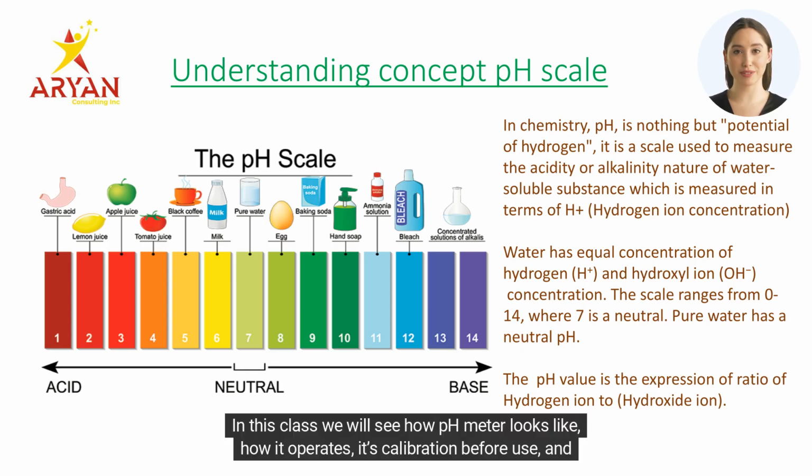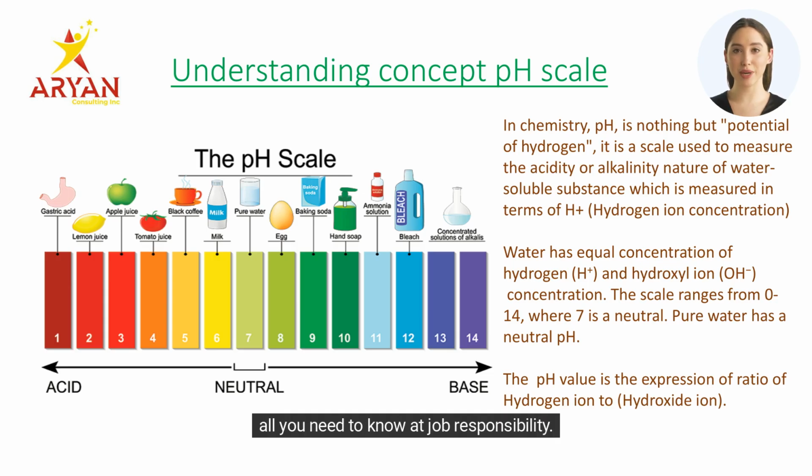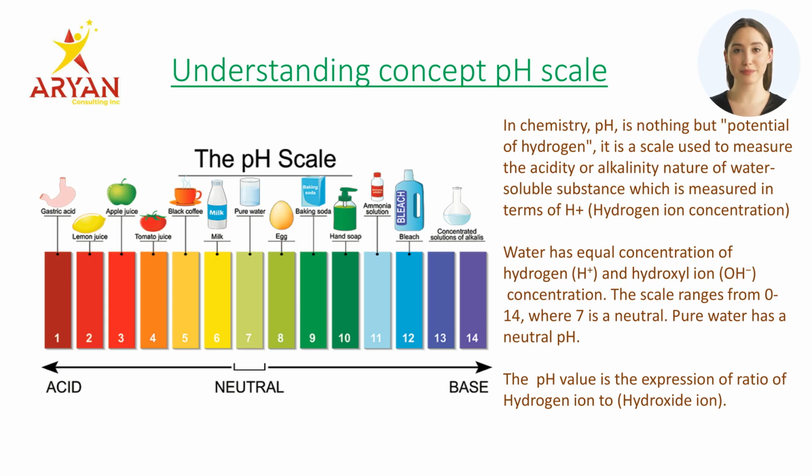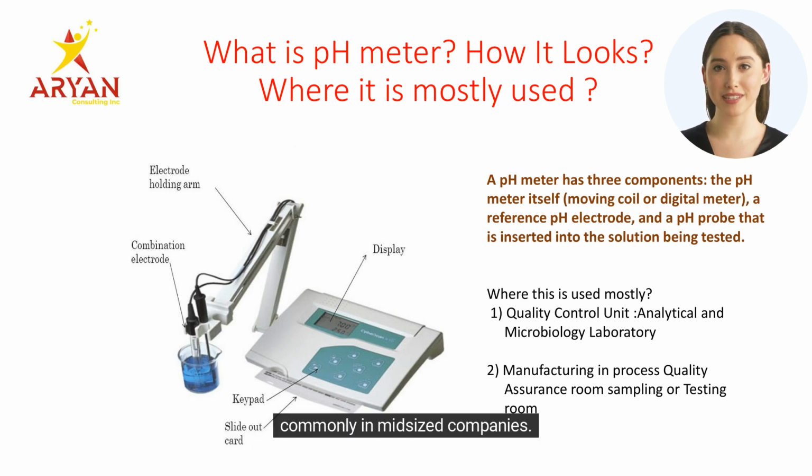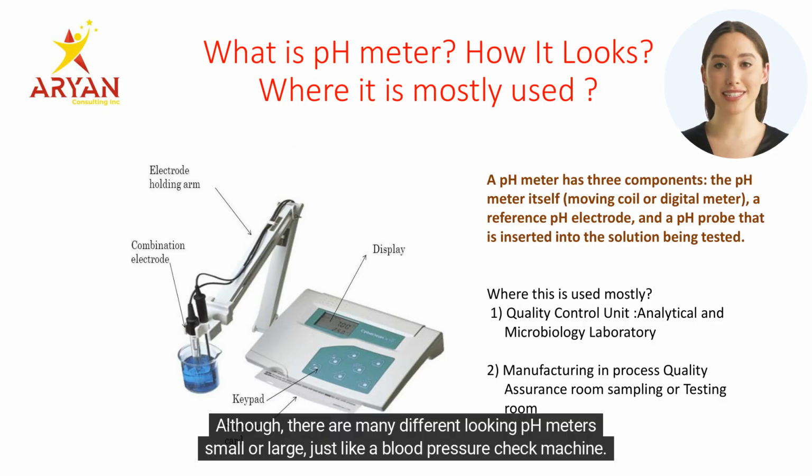In this class we will see how a pH meter looks like, how it operates, its calibration before use, and all you need to know as job responsibility. Now, as you can see the pH meter image on your screen, this is just a model of pH meter that is being used commonly in mid-sized companies. Although, there are many different looking pH meters, small or large, just like a blood pressure check machine.